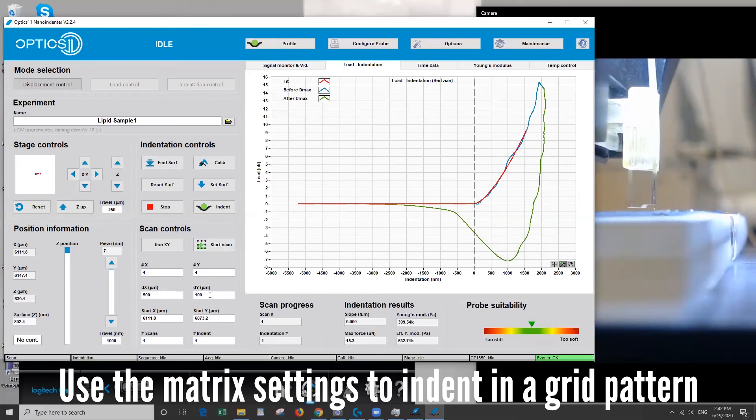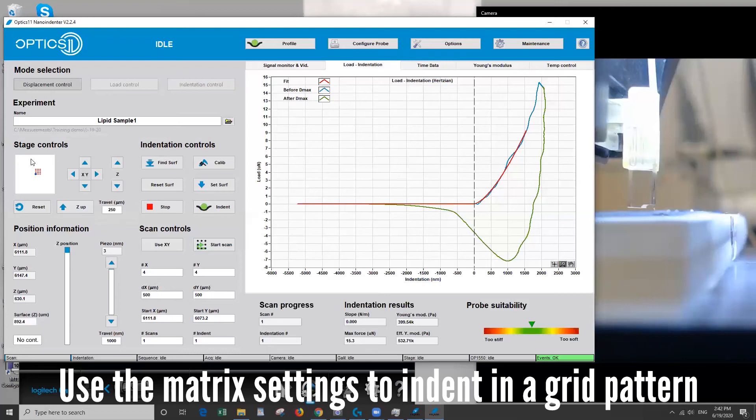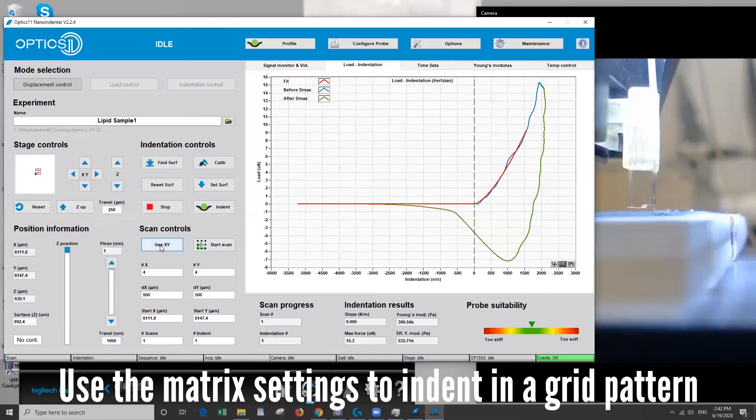And you can see over here on the map you can see my grid here. Because we're going to move so far between the data points, that's good because then the spot won't overlap with the next indent. You can choose use XY to make sure the grid starts where the probe already is.